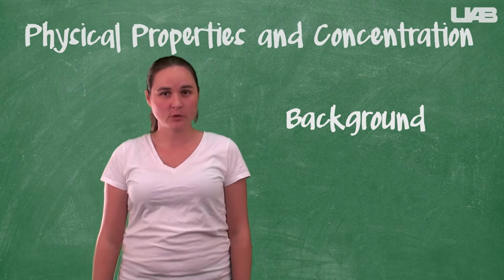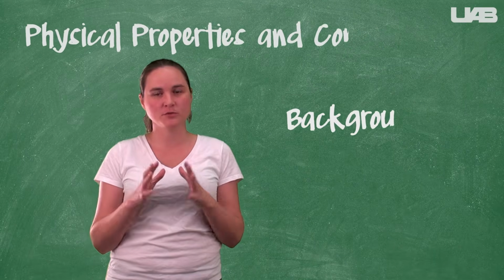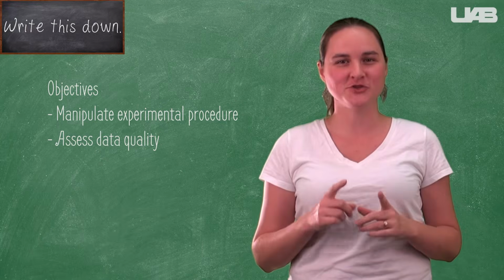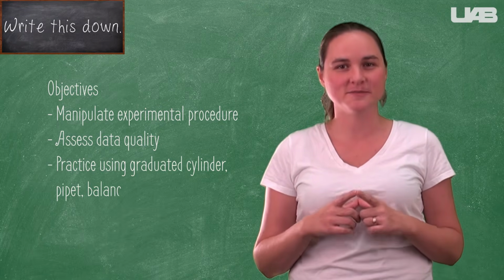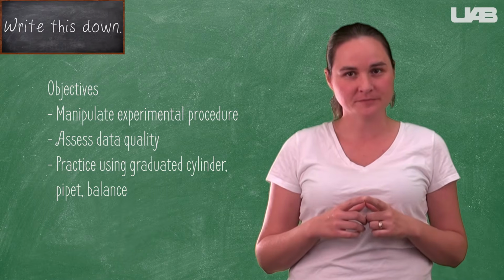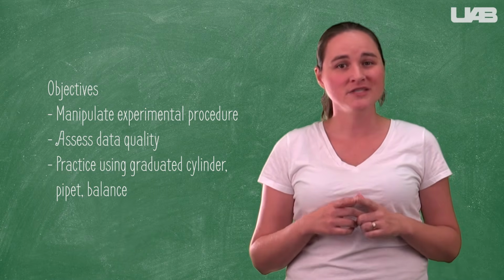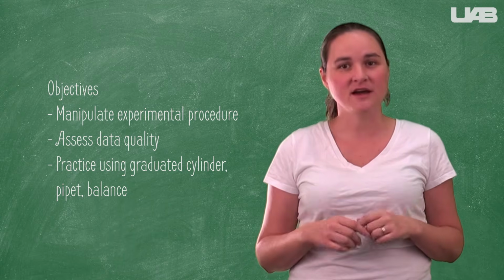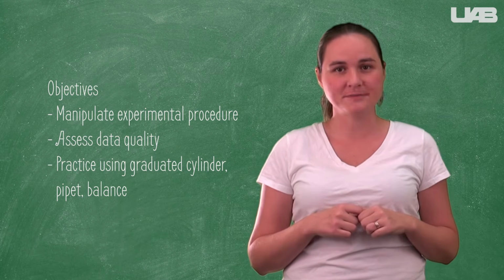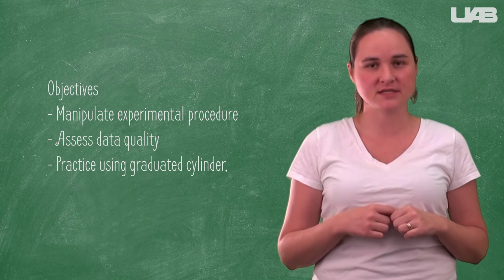During this week's lab, we will be exploring physical properties of solutions in an effort to become more comfortable with the laboratory setting. By the end of the period, you should be able to use, prepare, and alter an experimental procedure, decide if your data is precise enough to be usable, and be familiar with some common laboratory glassware. Notice that, under these objectives, find the density of water is not listed. The steps that you will follow to find the density will lead you to completing and learning the objectives for this laboratory.